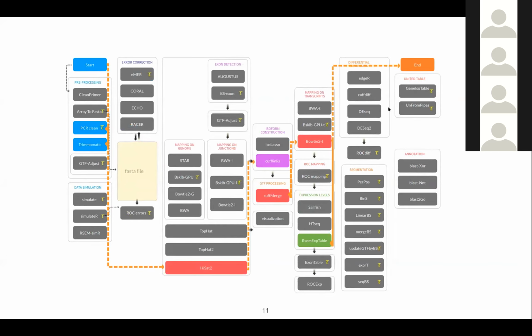These two pipelines are examples of how the whole process, all of those three steps, are connected into a single process. This process takes the raw FASTQ files, removes some of the sequence elements from the raw files, and then those files are mapped onto the reference genome, and then we want to count: what did we get?